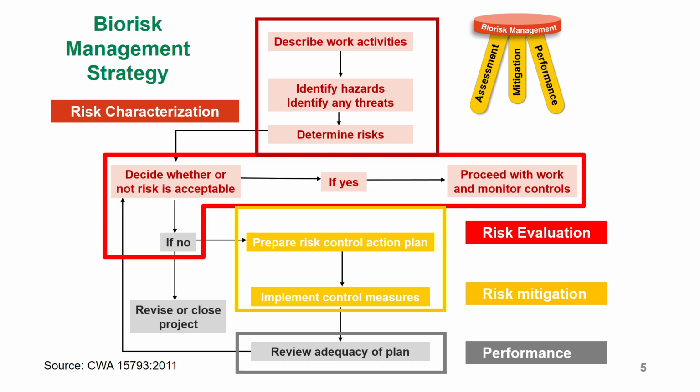So if at that point there is nothing you can do, there's no control measure that you can put up, you revise or close the project, because at this particular point you've determined as a facility that people will still be exposed, or the risk of exposure to the people in the lab to this Ebola is still high, and there's nothing we can do about it. Therefore, you revise or close the project.